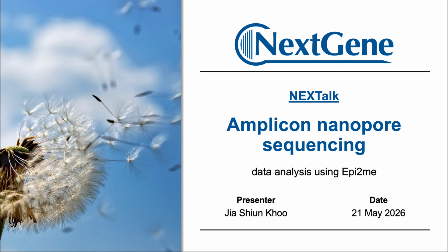In the next sessions we will have more details on the bacterial genome pipelines in EPI2ME. You are welcome to come back then, and we can go through in more detail what is covered within the bacterial genome pipelines. So the quick answer is, sorry, no KEGG annotations at the moment.